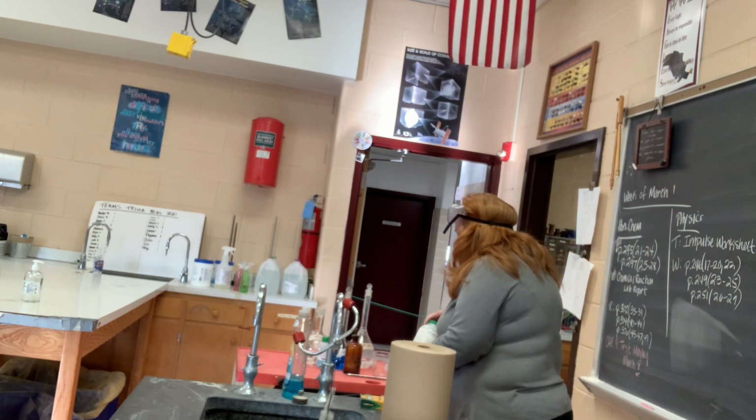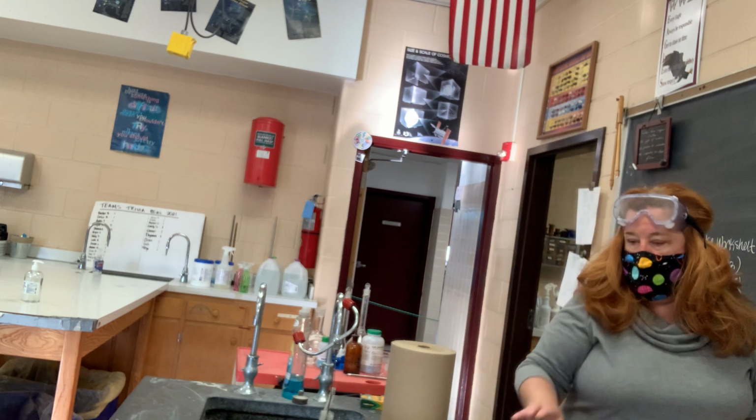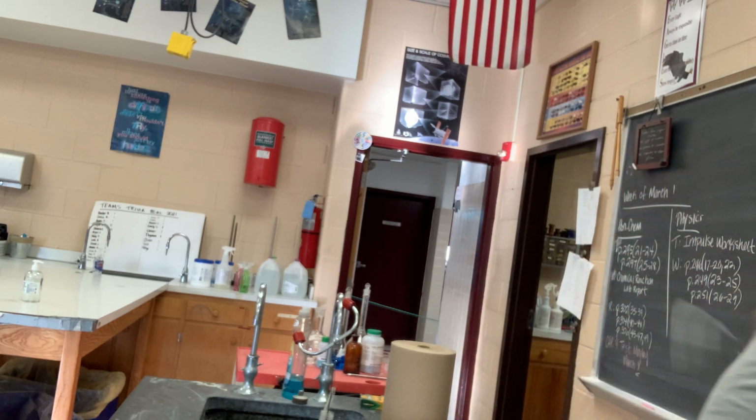Those are too big. I have to go back in the chemical room. I'll be right back. If you want to work on those a little bit, I'll be right back. I have to get smaller zinc.